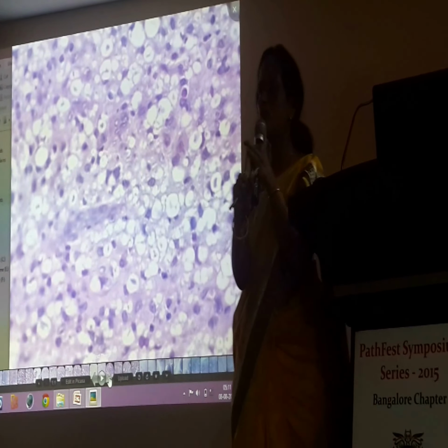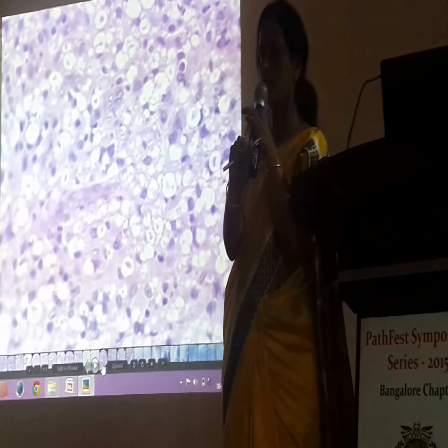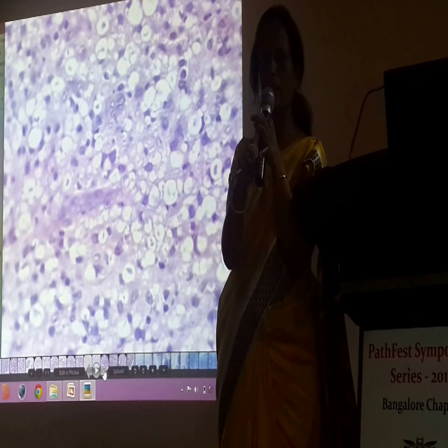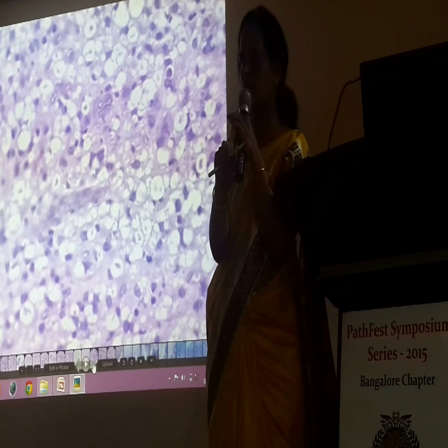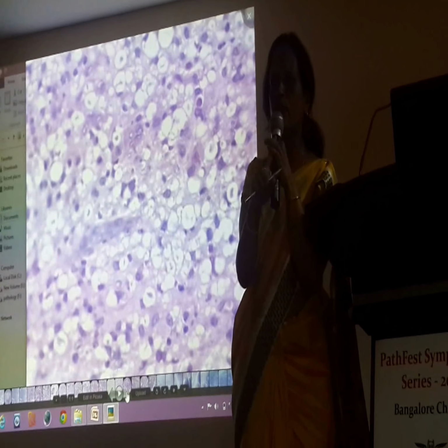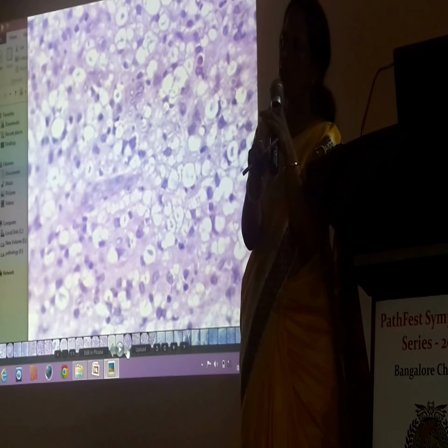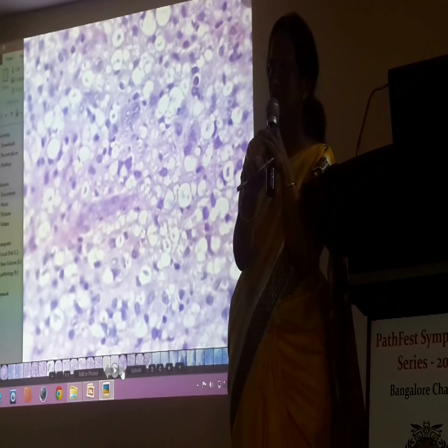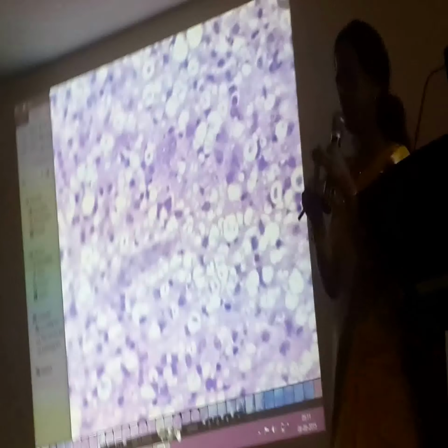Then, after you do everything, please don't go to alcohol for dehydration. Even when you do a smear or tissue sections, or skin sections for lepra bacilli, because AFB, we say for Mycobacterium tuberculosis, is acid and alcohol fast. This is just acid fast, but alcohol may remove the stain that the bacilli have taken.